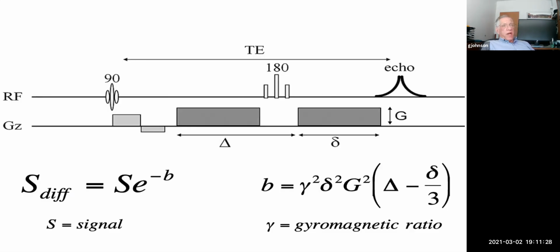And we do that with a classic MR sequence. This is the so-called Stejskal-Tanner sequence, named after 2 actually local physicists, 2 gentlemen from North Carolina State University. This is a sequence that was developed in the 60s, and it consists of a 90-degree RF pulse, which excites the spins, brings them down into the transverse plane. Then there is a gradient along any one of hundreds of different directions that encodes the diffusion during this period delta. Then there is a 180-degree pulse that refocuses the diffusing spins, and then another gradient that unwinds the spins.